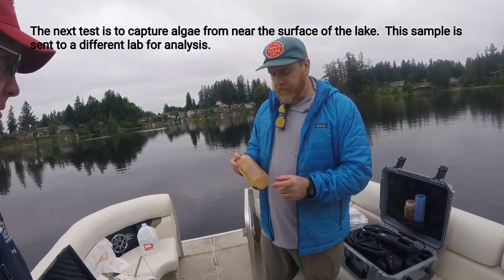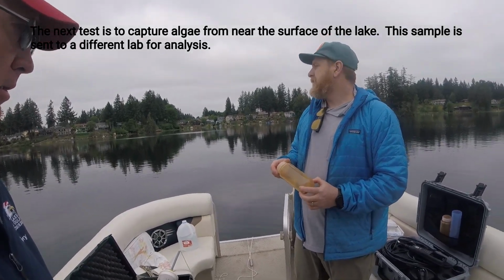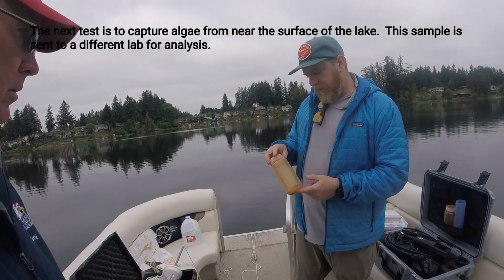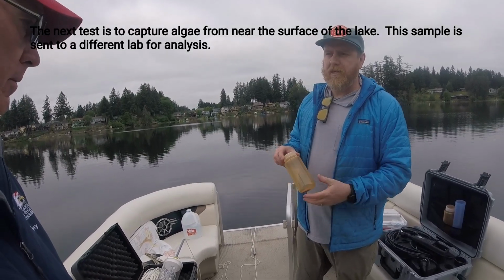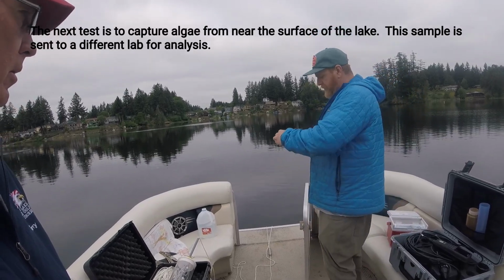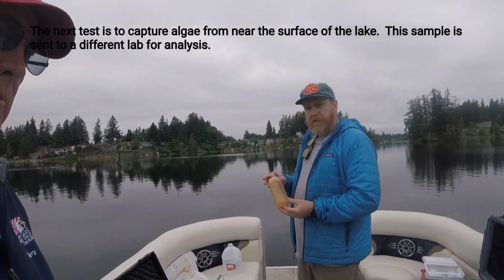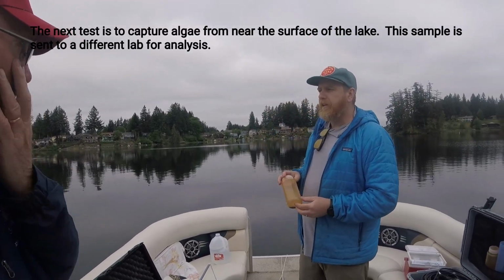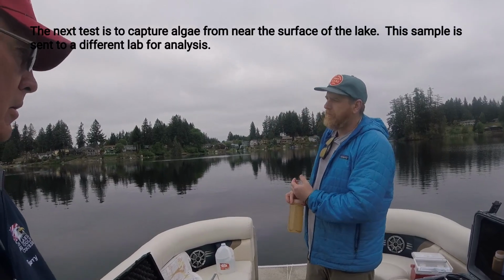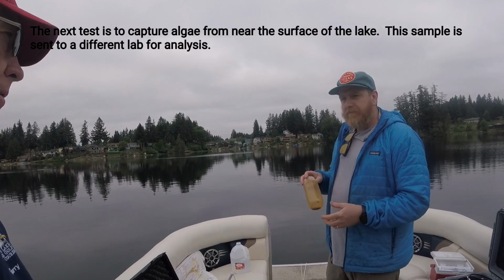Put the algae sample in one of these collection bottles. It has a special type of iodine in there, so it preserves the algae species, and it stays preserved for quite some time with this. Is that sent to you by the lab too? No, I had to purchase it. You can request it. The algae processing is done through a different lab.